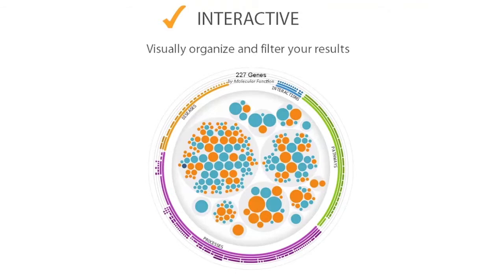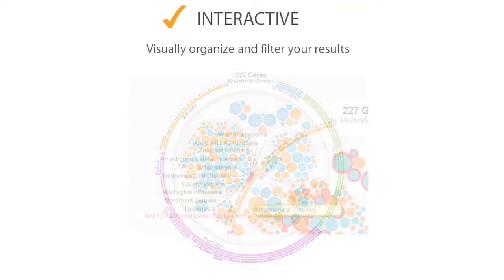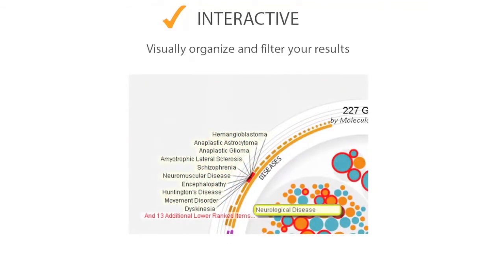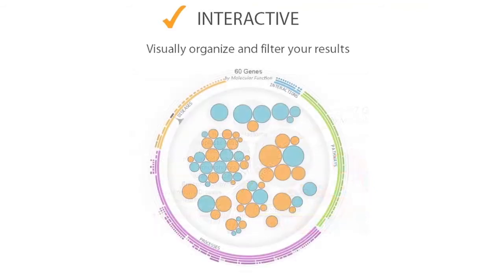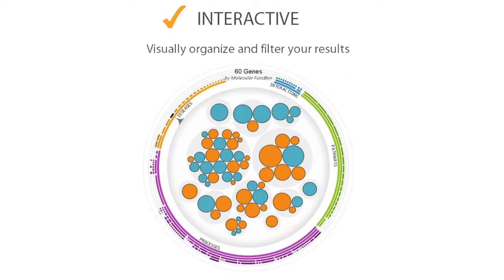Each gene is represented as a colored circle. You can click on a section of the wheel to filter down to just those genes relevant to a particular biological category, such as diseases, pathways, biological processes, or molecular interactions. Here we filtered from 227 genes down to just the 60 known to be involved in neurological diseases. This is just one of the many ways iReport helps you organize and filter your results.